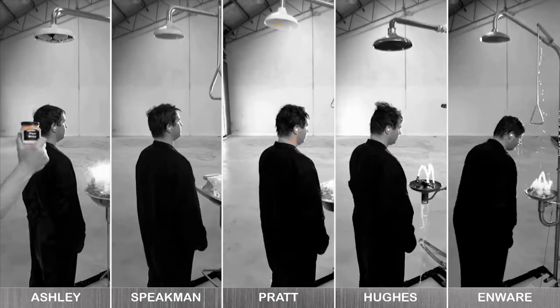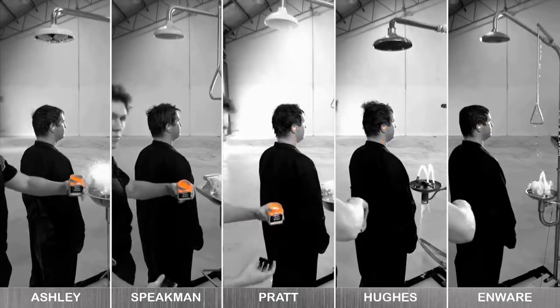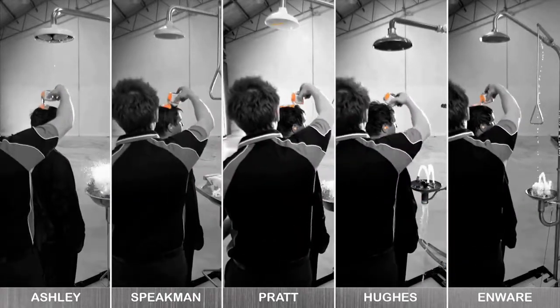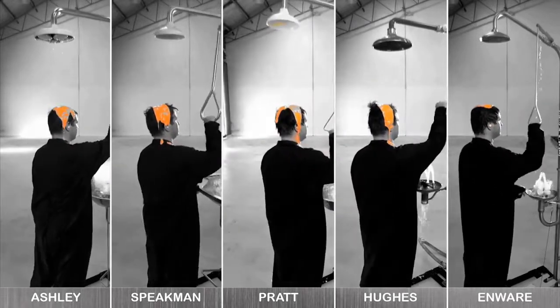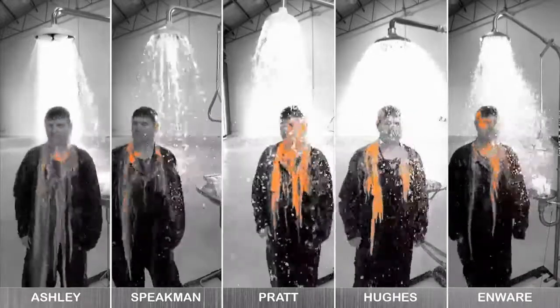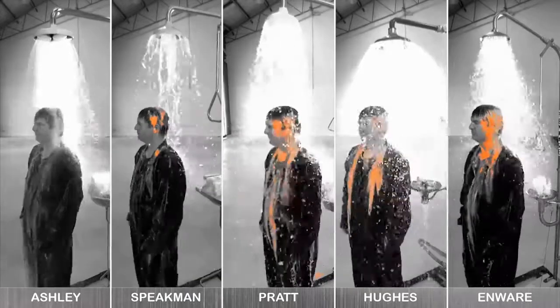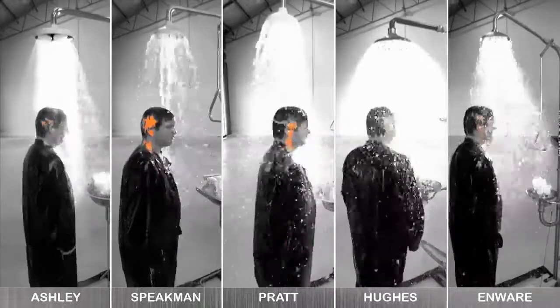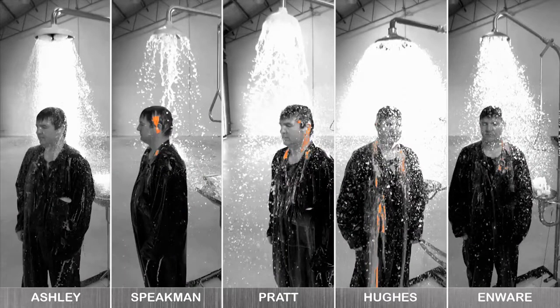In this demonstration we'll be using an acrylic body paint to simulate our chemical. Each time the same amount of paint will be applied to the user, and the same water pressure and volume will be deployed in the same time. Look how quickly and effectively Ashley's shower removes the orange chemical. At this point there's virtually no chemical remaining. A final look indicates that Ashley's shower not only removes the chemical quicker, but it removes more chemical than any other shower in the allotted time.